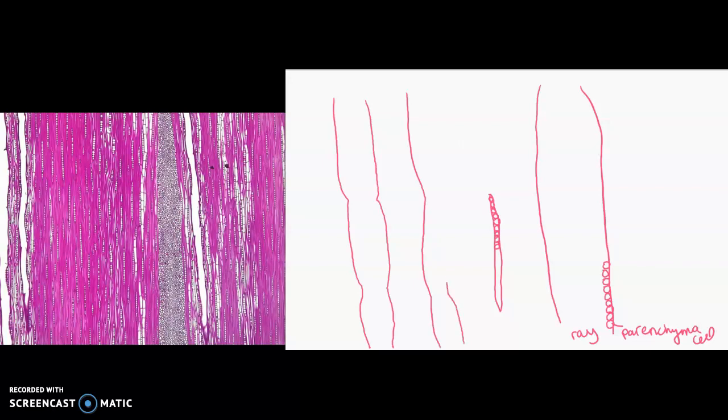The other thing that you'll see a lot of, which reminds me of roundworms, but they're not, are very thick-walled fibers, very, very long, and they look pretty much solid as they run throughout.